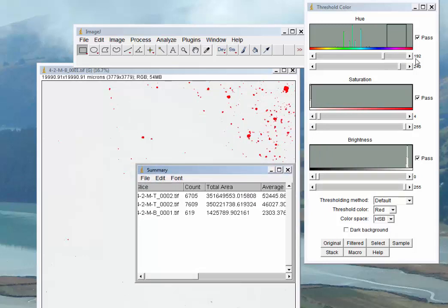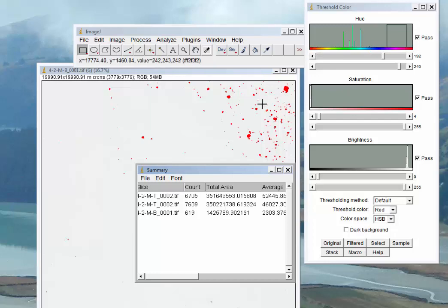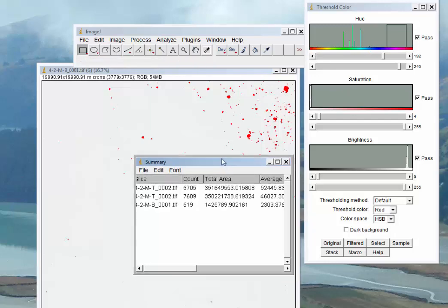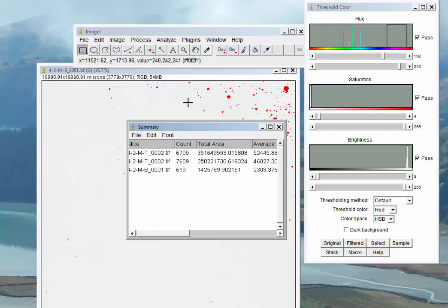It looks like we're pretty close at this point. We've adjusted a little bit off of our seat-of-the-pants number. Instead of 198, we're at 192. We've opened up the range a little bit because that's what the images told us we could. If you were using blue dye you'd pick a different range here, or orange dye you'd pick a range down at the end. But this is the basic process for thresholding, and the end result is you write down these numbers. That is your recipe for dialing in an image when you go to open a new scan and threshold.